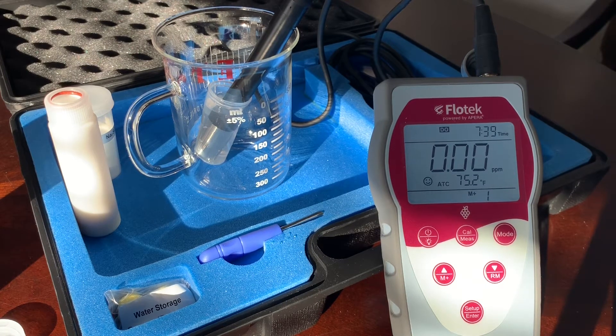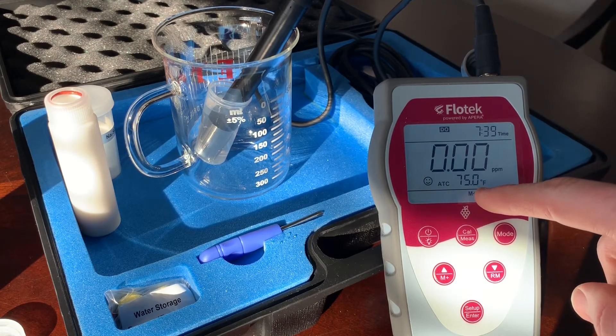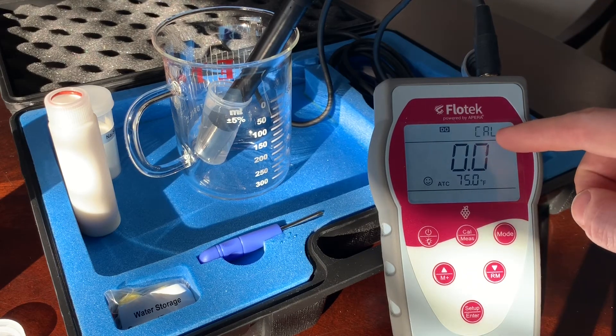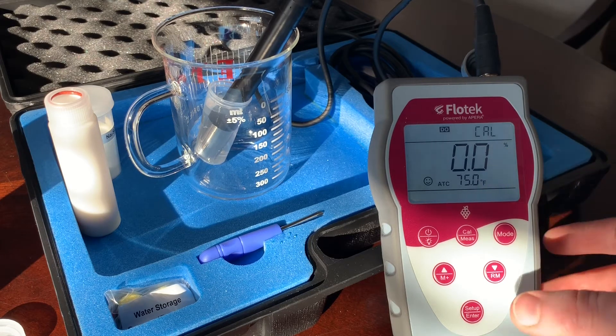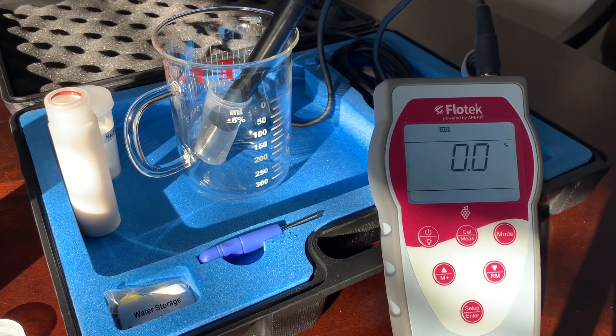Now that our probe has dropped to 0.0 and we have a stable temperature, we're going to perform the zero calibration. Hold the calibration measurement button for about five seconds to go into cal mode. Make sure that your reading is stable and your temperature is stable. If that's the case, go ahead and press setup, enter. That's your new zero calibration point.